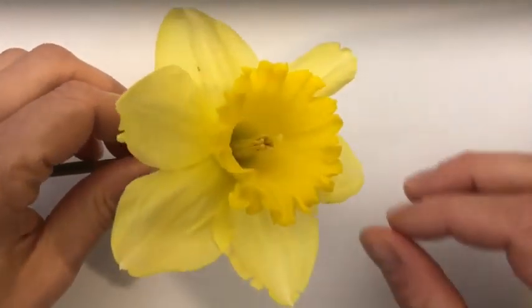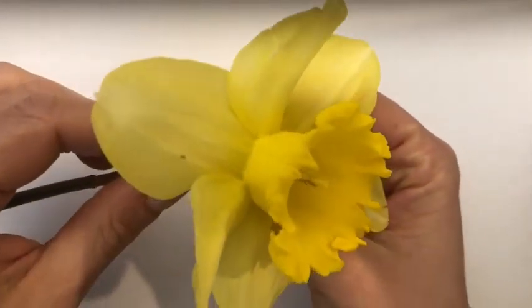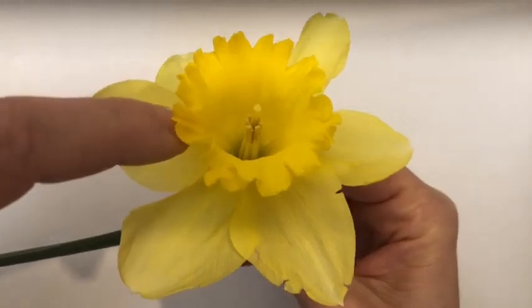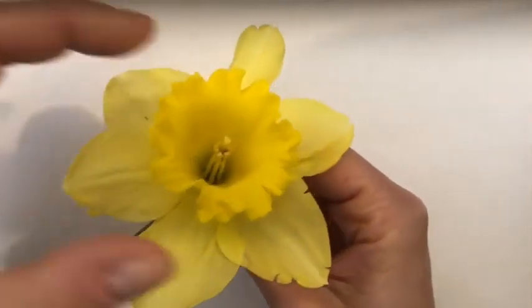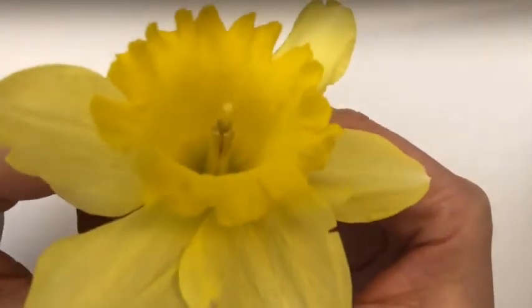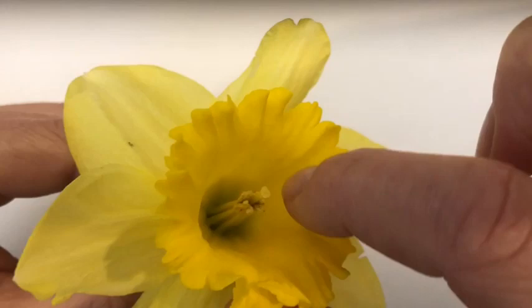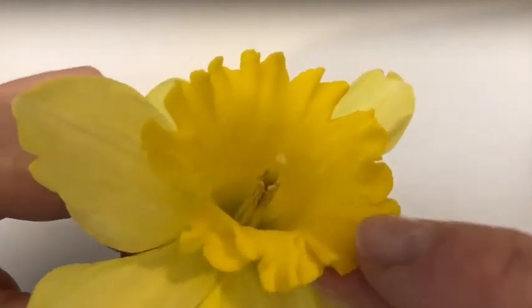Hopefully you have acquired a daffodil by now or some other big pretty flower. This daffodil has a lot of parts we can see without even dissecting it. We can see the petals — this flower has six petals — and we see this crown here which is often a different color in a daffodil. You can ask yourself why that might be. This piece is called the corona. You also see one piece that sticks up farther than the rest, and some other stem-like pieces that go around it.